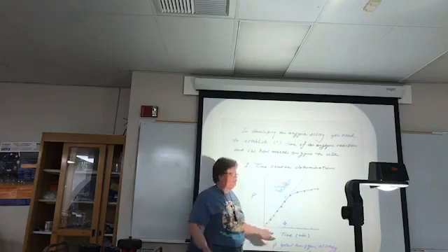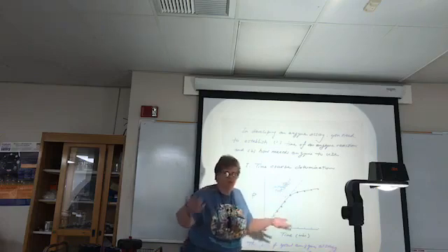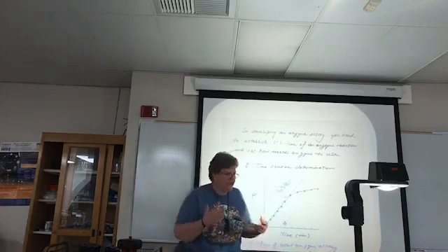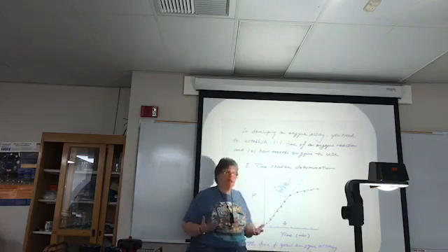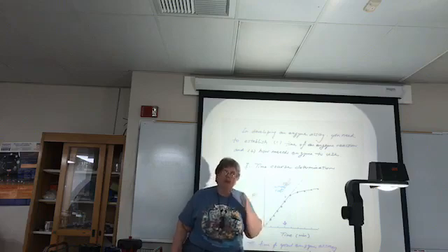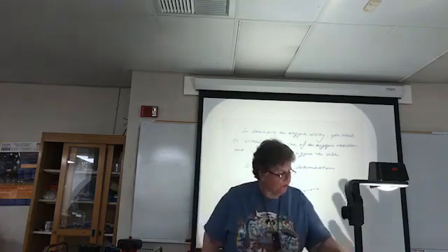So you have a little bit of buffer in there, and then mix in the enzyme and start measuring how much product is being formed. In a perfect world, you directly measure how much product is being formed per time. There'd be an initial rate, and then after a while it starts slowing down. By taking that initial product measurement, the change in absorbance versus change in time, that's your absorbance per time, and that can be converted with use of an extinction coefficient into a velocity for the reaction. So this is basically what you're going to be doing.